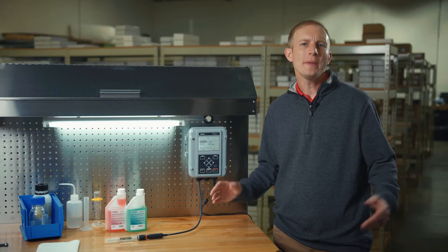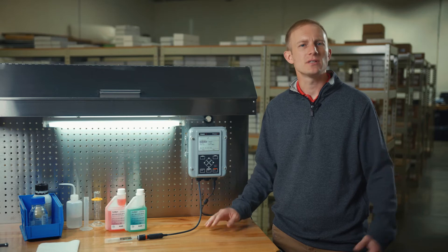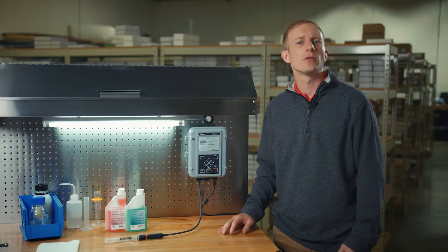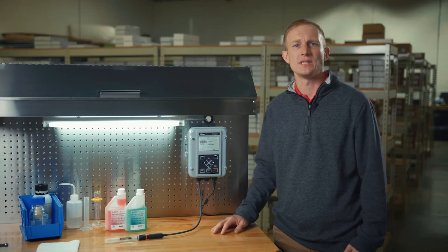Once within the calibration menu, we'll select the MemoSense pH sensor connected to channel 1 of our transmitter. I will be conducting a CALMATIC or automatic calibration today, but here you can see the different options available for calibrating. The Protos enables us to perform a manual calibration, a product calibration or a single point standardization, adjustment of the electrode slope and zero point via data entry, and lastly, adjustment of the internal temperature detector.